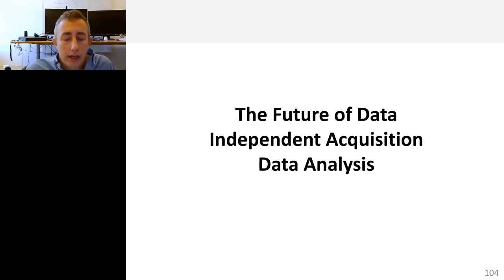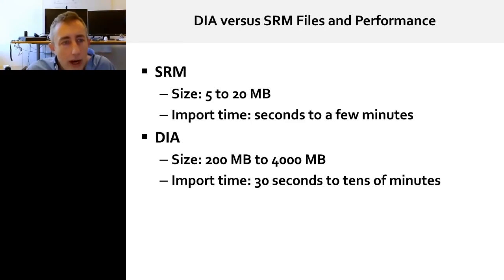So there are still some issues here. I made this sound fairly straightforward: we have software tools that can manage this. There is a dirty little secret in doing these analyses, and that is when you try to measure these things by data independent acquisition, we have a big difference in simple things, just like file size.